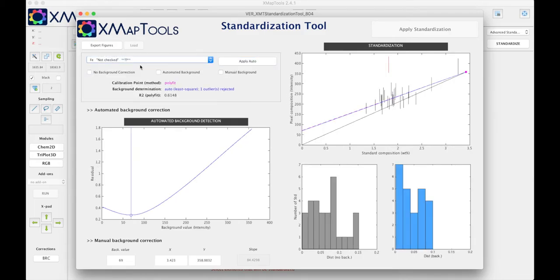Now I go to iron and we see that for iron things are different. If we fit the data, this is the blue curve in this example, we see that we have an intercept that is greater than zero, here 69, and this is the value of the background that we reconstruct from the spot analysis and the pixel composition.